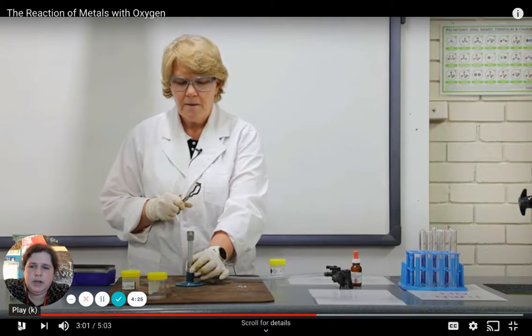So what she's doing right now is adjusting the flame, and she does that by opening and closing a valve at the base of the Bunsen burner, which allows more or less oxygen to come in. If you see a blue flame, that means there's a lot of oxygen and it's burning really well. If it's a yellow flame, that means the valve is closed. There's not very much oxygen getting through. It's not a very complete combustion reaction.